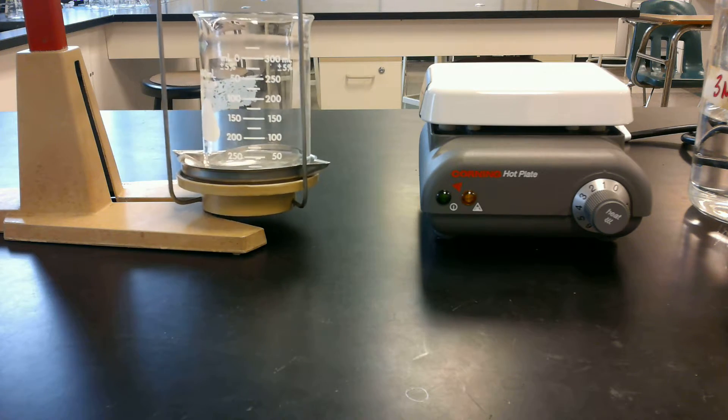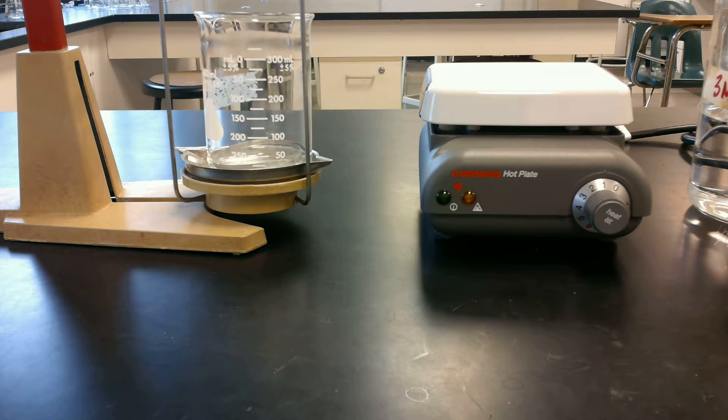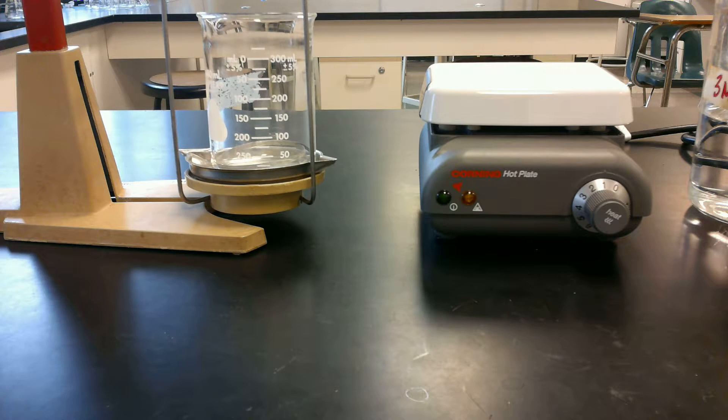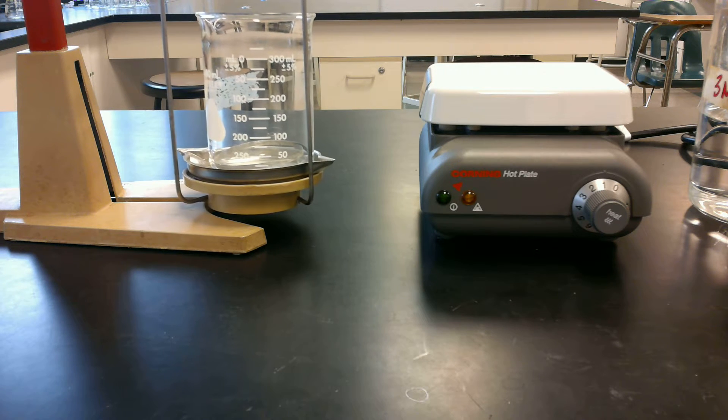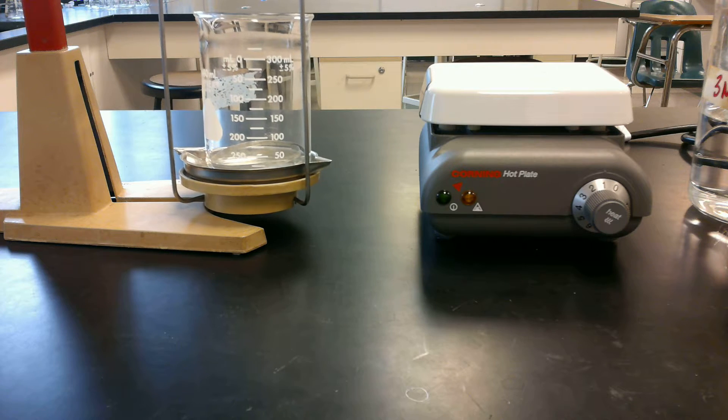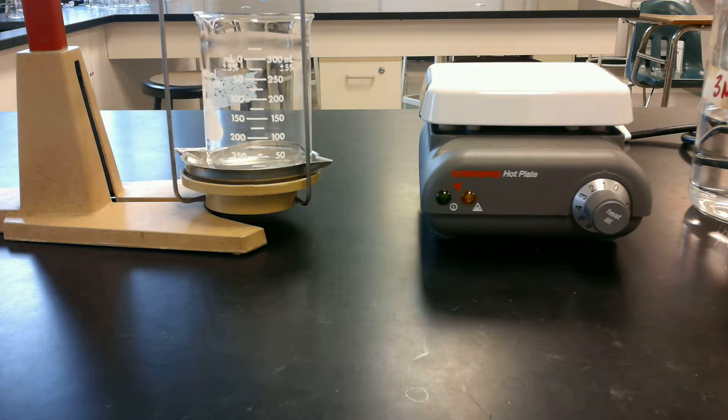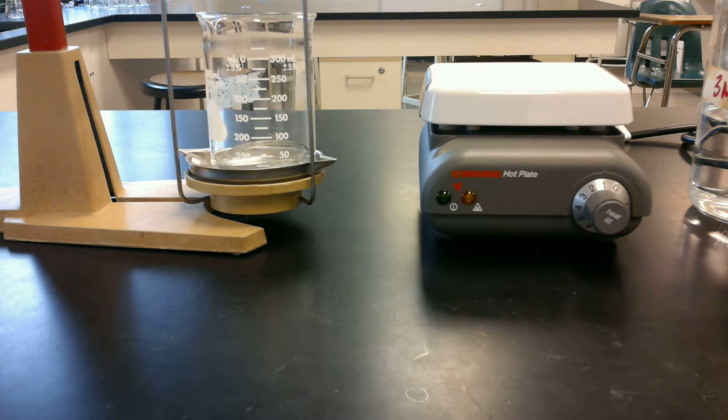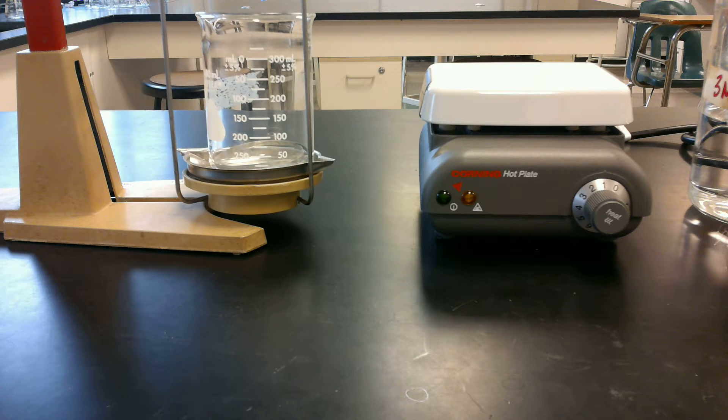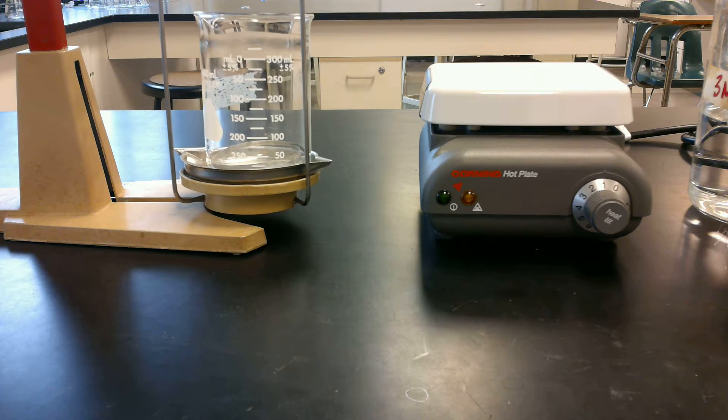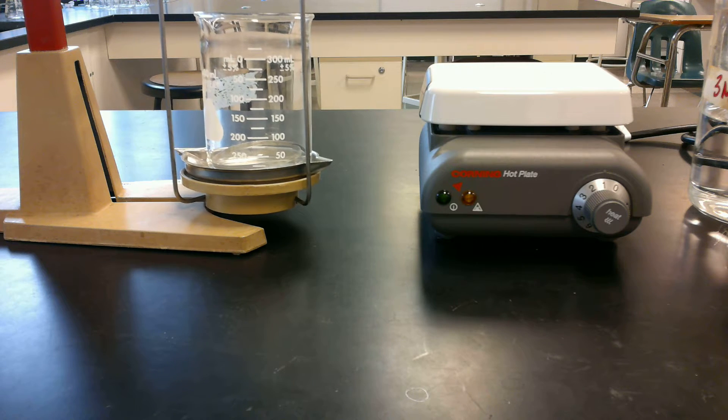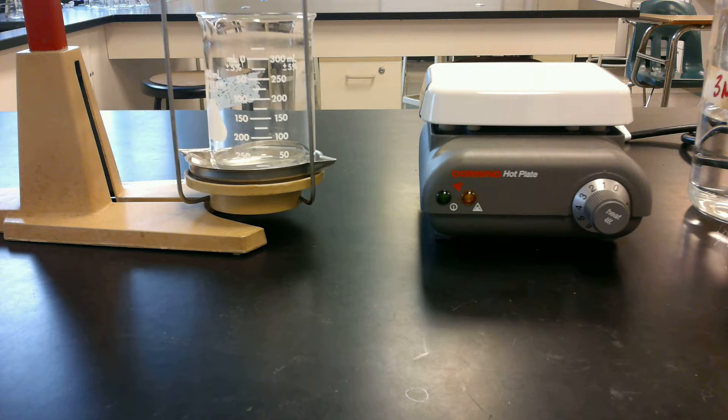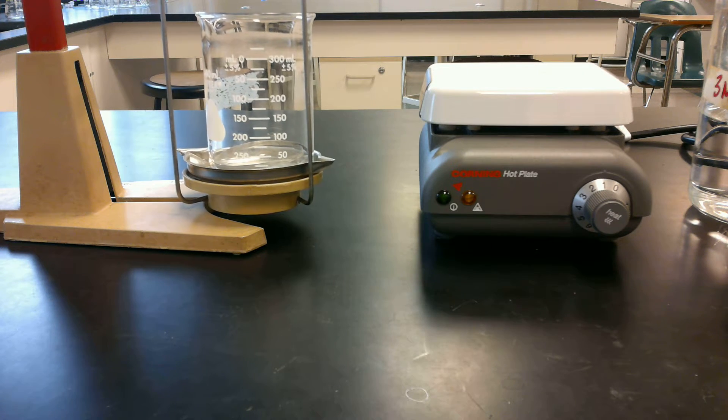And so you're going to repeat those steps, heating it, weighing it, heating it, cooling it, weighing it, heating it, cooling it, weighing it, until you notice that the mass is not changing or going down anymore by more than 0.05 grams. So that means you're basically getting all the water off and you're making sure that it's staying off. Now you've got to be a little bit careful because if you heat it too vigorously, sometimes magnesium chloride can actually decompose into chlorine gas. And so that's going to obviously be losing some of that. So you want to do it gently. But as long as you've heated it all off, it's not going to differ by 0.05 grams. You're going to record that stable mass.